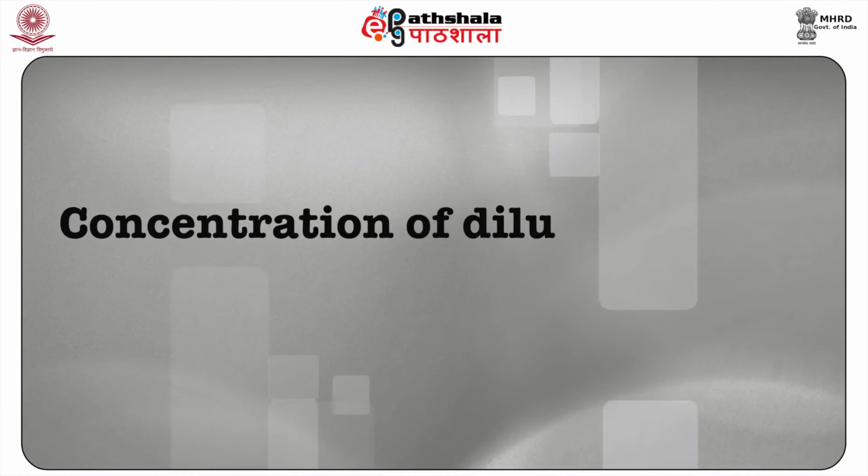Second is the concentration of dilute solutions. Dry Sephadex, that is G25 coarse, when added to a dilute solution of a high molecular weight substance, absorbs water during the swelling process. The high molecular weight substance, however, remains in solution due to its complete exclusion.